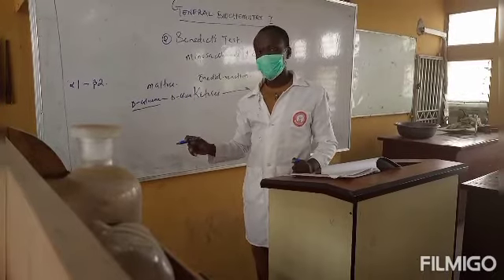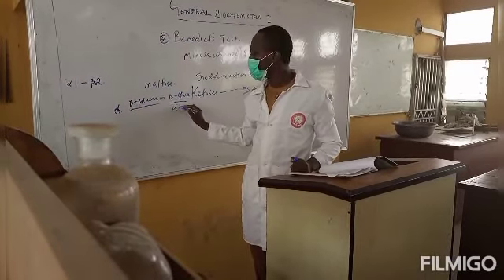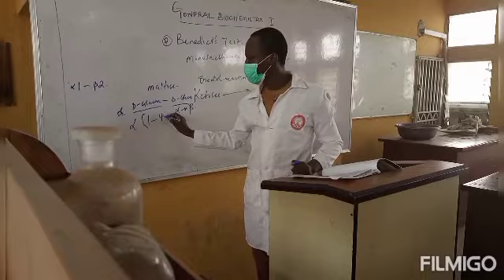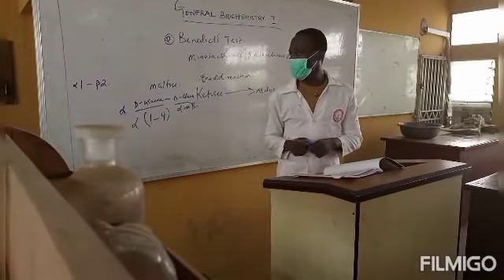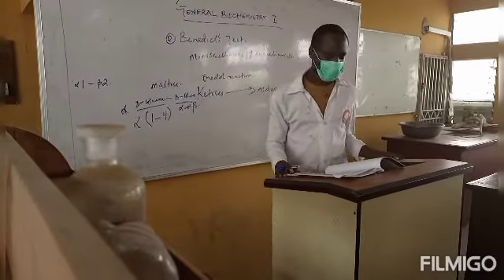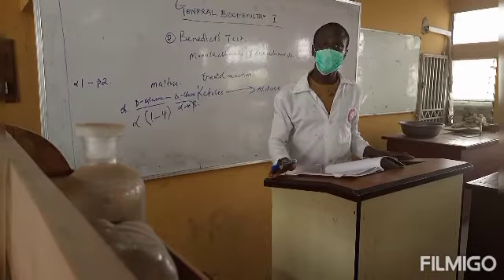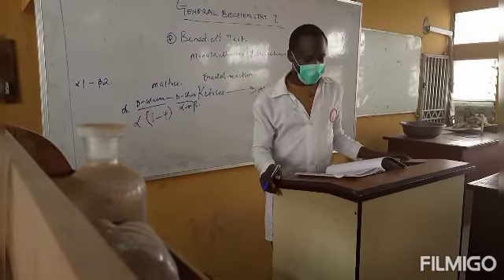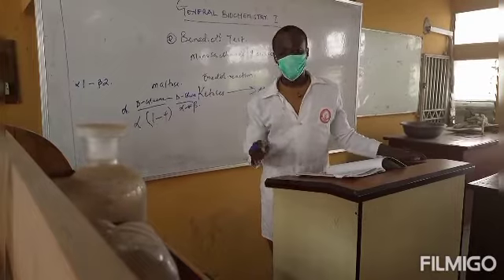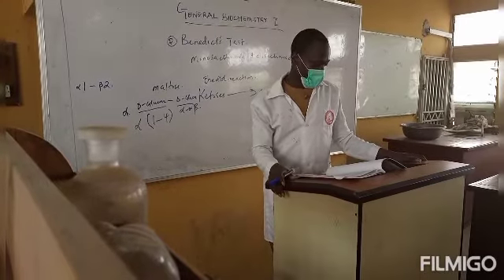The first D-glucose is alpha D-glucose, while the second one can either be alpha or beta D-glucose, and they are joined together via an alpha 1,4-glycosidic linkage. The reason why maltose shows a positive result with Benedict solution is because it has a free anomeric carbon. If you remember from our theoretical aspect, we made mention of anomeric carbons. The anomeric carbon in the second glucose is not used for the glycosidic linkage.